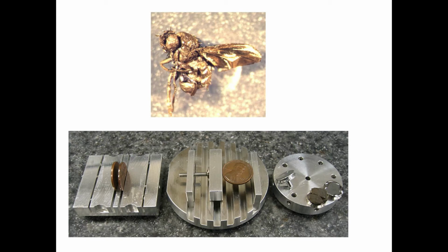Let us see. Size and cost: we cannot put bulk-size workpieces inside the machine, and the cost is also very high, crores and crores we have to invest, and the maintenance cost is also high. SEMs are expensive and large, and difficult to maintain. Operator skills are also needed, otherwise you cannot get clear-cut images. So it is limited to solid, inorganic and small samples; for big samples it is very difficult.